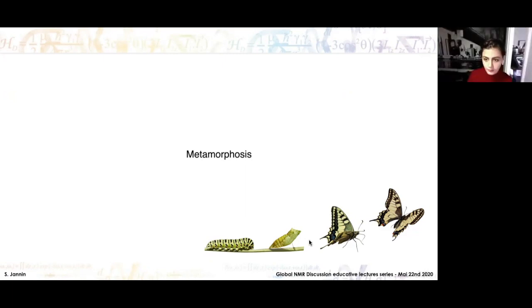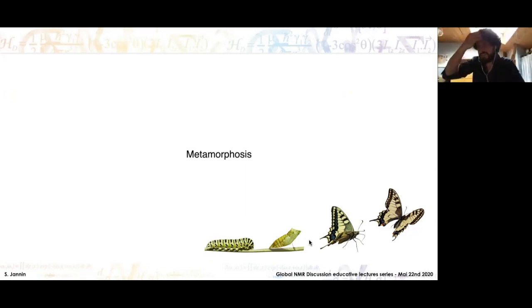Thanks, I did not get the question this way. Polarizing the protein is very easy, but having the protein survive the dissolution and transfer is another story. But if you have a protein with sufficiently long T1s that can survive the temperature jump, then why not? But I guess that's maybe not the best way to go. Water is a good polarization reservoir.